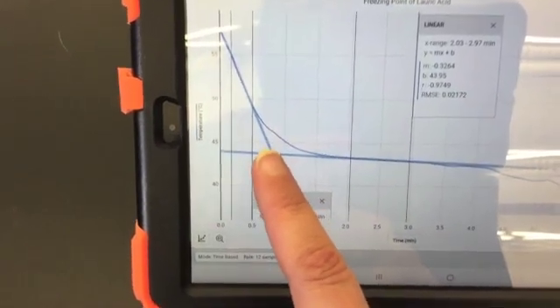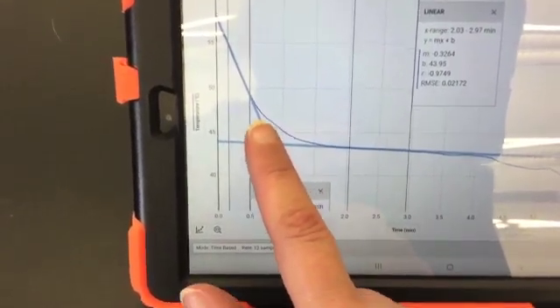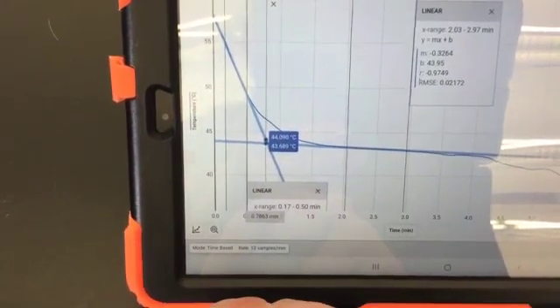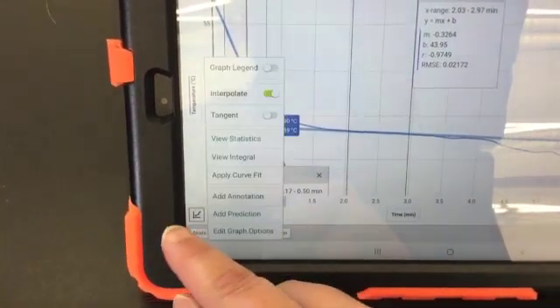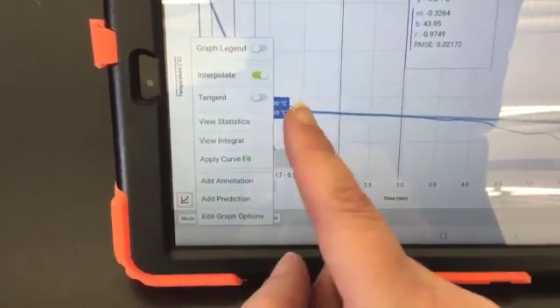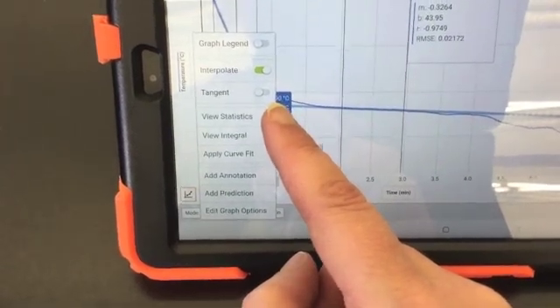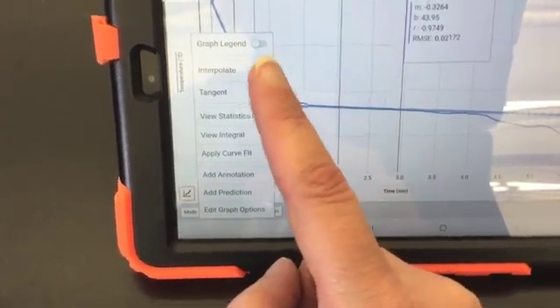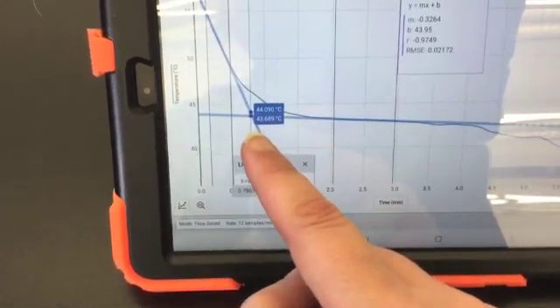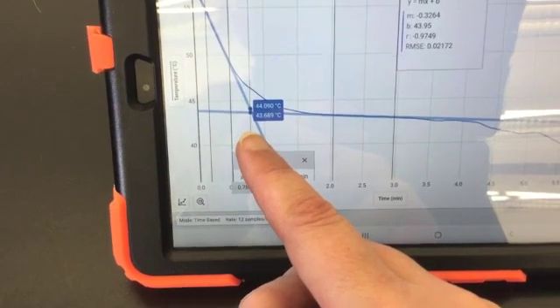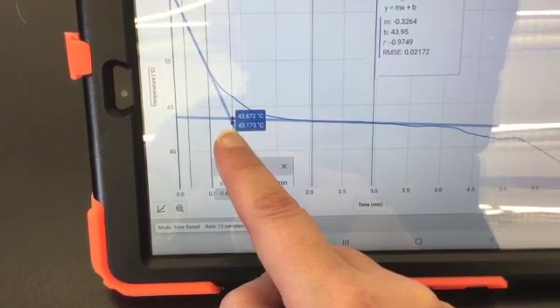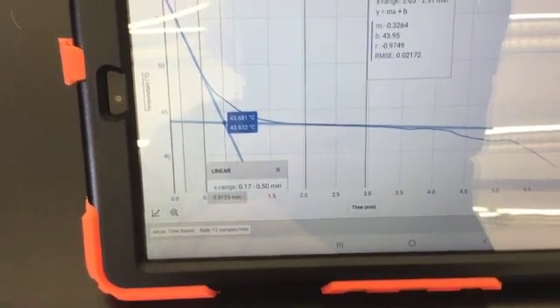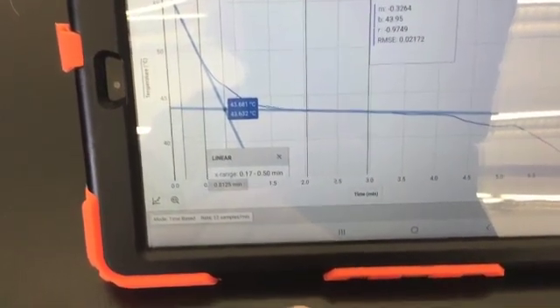We're interested in the region where the two lines overlap. I can touch on that line, and if I want to see what that data point is, I'm going to click here and turn on interpolate. If you don't see the two numbers corresponding to the two data points from the separate lines, you will have to toggle on the interpolate switch. In this case, it is showing me that one of these is at 43.7 and the other at 44.09. I want to move this over to where they're a little bit closer — there, that looks like a good overlap. So I'm going to write down 43.6 as the melting point of my lauric acid.